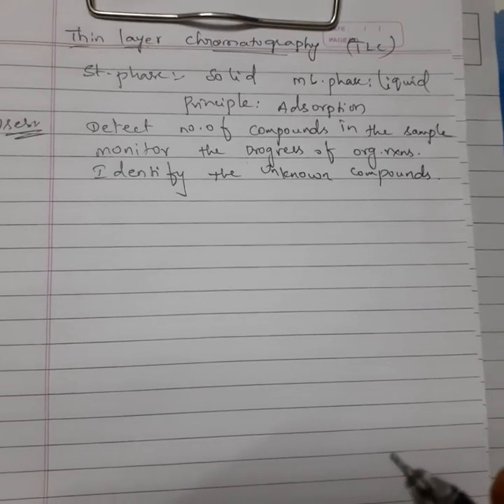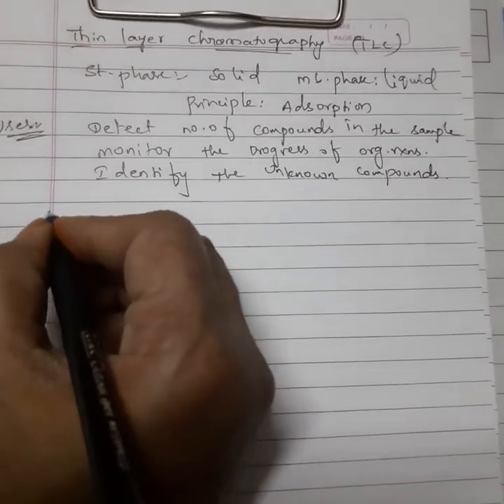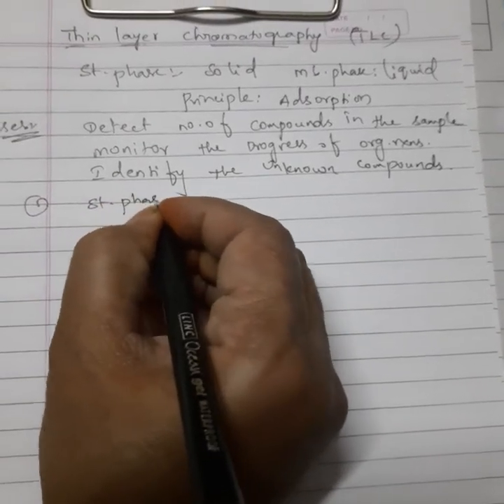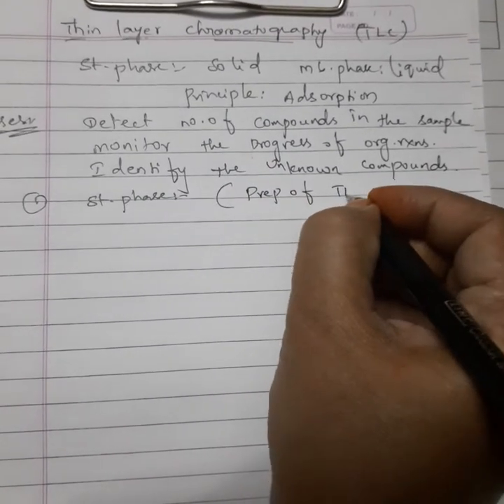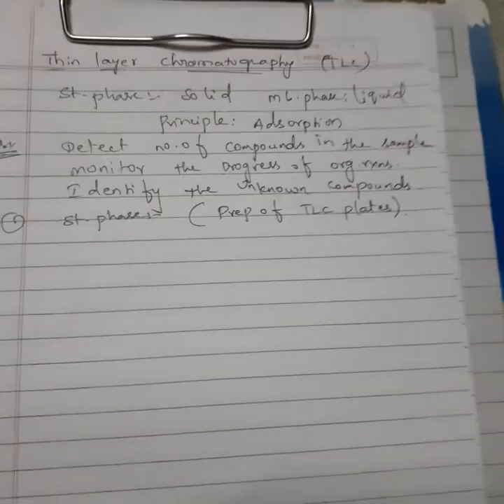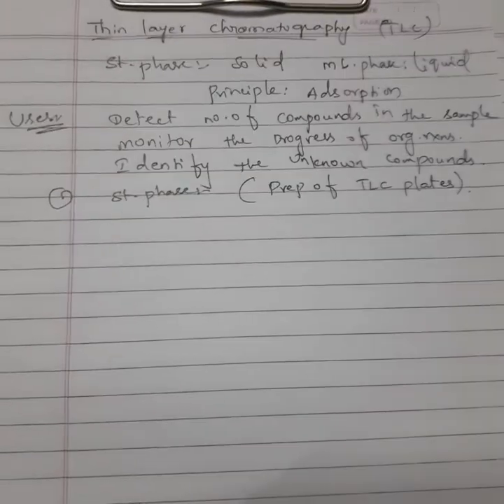Now we will enter into the TLC experiment. We have different steps. First one is the stationary phase, which we call the preparation of TLC plates. Actually, the preparation of TLC plates is the main task in thin layer chromatography.